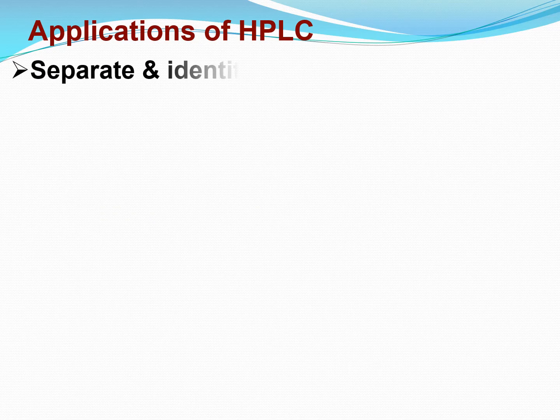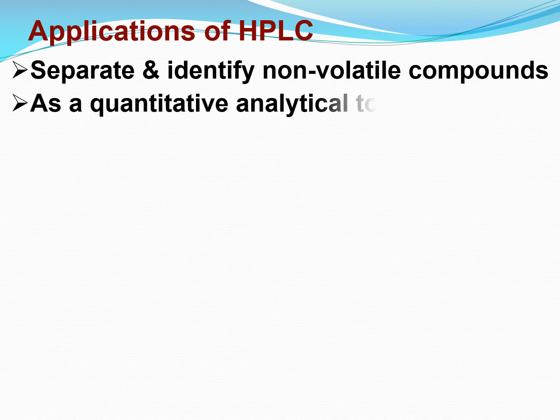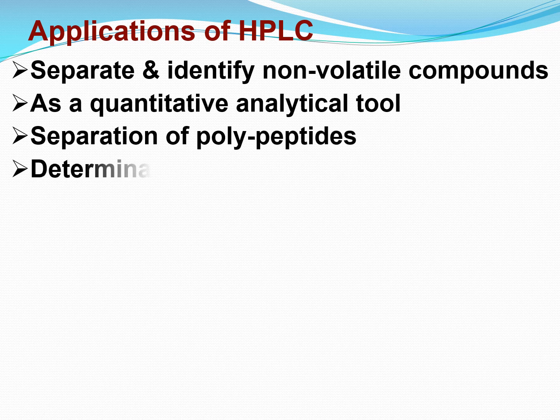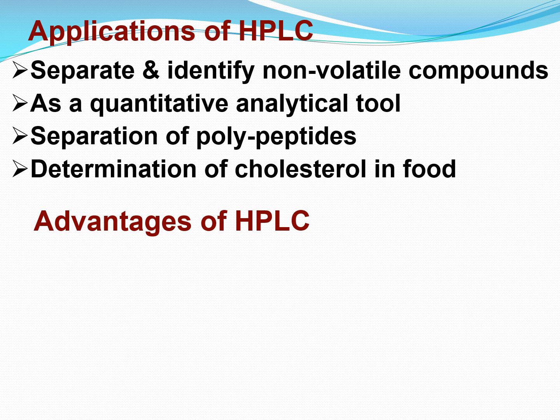What are the applications of HPLC? Separate and identify non-volatile compounds, as a quantitative analytical tool, separation of polypeptides, determination of cholesterol in food. These are some of the applications of HPLC.